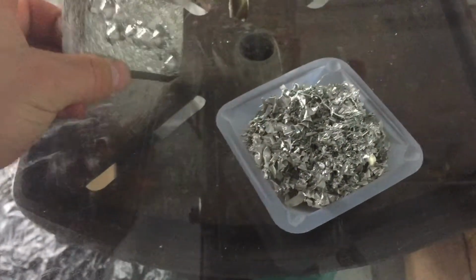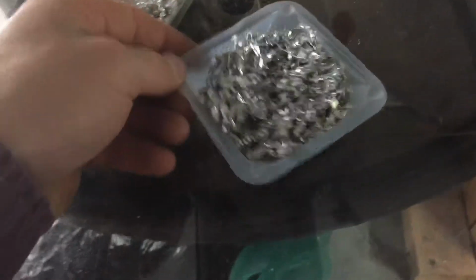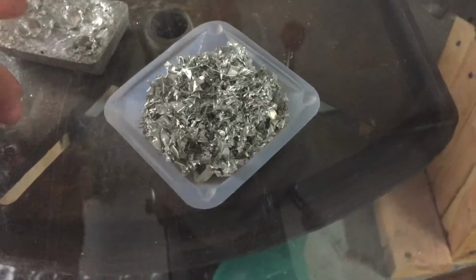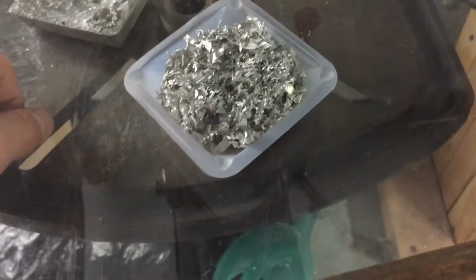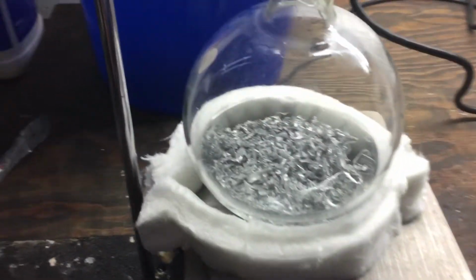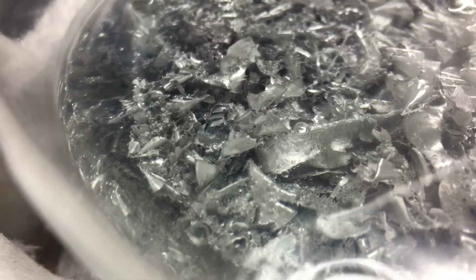All right, here we are. Got about 56 or 57 grams of tin right here. I just weighed it, and now it's time to set up the apparatus for the dissolving of the tin into solution. So I just added the tin to hydrochloric acid, and as you can see, the gases are being evolved very quickly here.